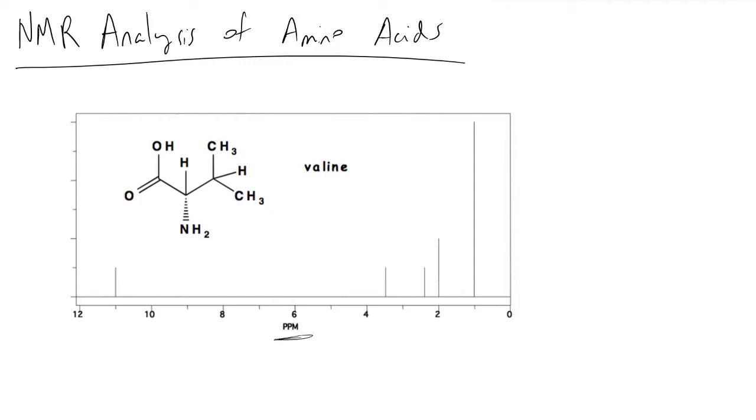We've got this ppm value, a chemical shift, denoting our x-axis. And this y-axis is kind of arbitrary units that just denote intensity. And this is one form of an NMR spectra. The main thing we're looking at here is the chemical shift values for each one of these peaks.